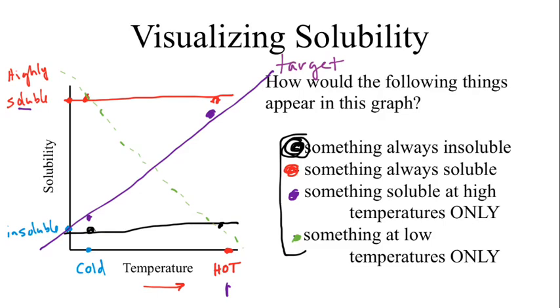What about the other two curves? The red and the black. Well, the red one is highly soluble, so this would be an ideal soluble impurity. For instance, if we added, say, salt to it and we just try to dissolve it in water. Water will dissolve our salt at all temperatures. It makes sense for that to be our ideal soluble impurity.